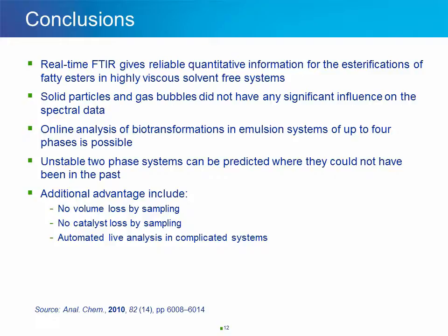I want to highlight just a few of the conclusions that the researchers made. That real-time in situ FTIR information in combination with multivariate data analysis gives reliable predictions for the enzymatic esterification of fatty acid esters in highly viscous solvent-free systems.